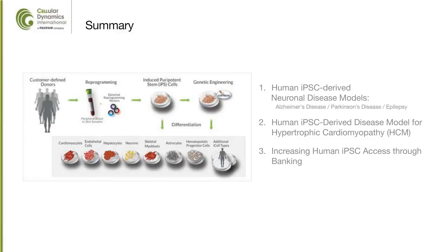A really good question, and obviously something that needs to be investigated more. Here's an example of whether the model definitely recapitulates the human condition. In a lot of aspects of Parkinson's, we see in the human condition, in other models, a lowered spare respiratory capacity. In the cells that we've created with the A53T mutation, we actually see a significantly increased spare respiratory capacity.